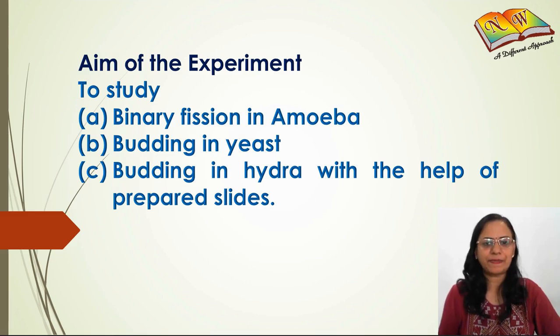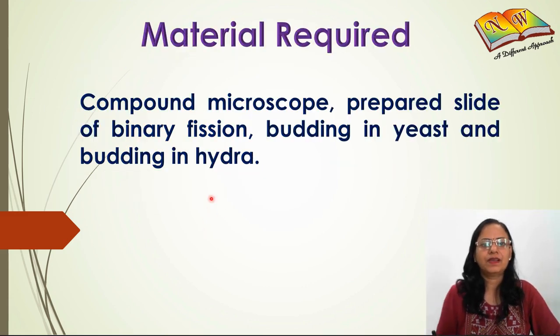The aim of this experiment is to study binary fission in amoeba, budding in yeast, and budding in hydra with the help of prepared slides. So material required is a compound microscope and already prepared slides of binary fission in amoeba, budding in yeast, and budding in hydra.